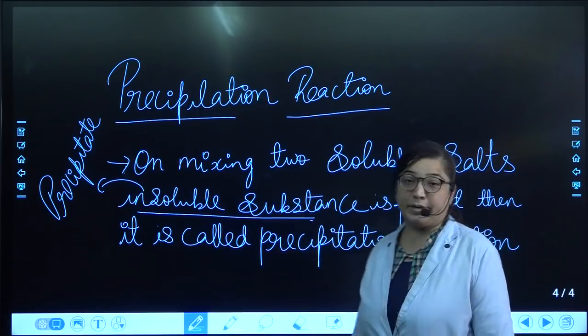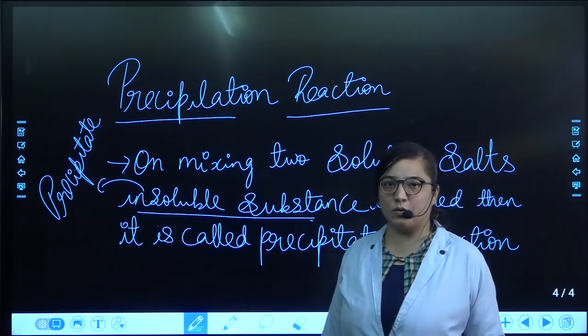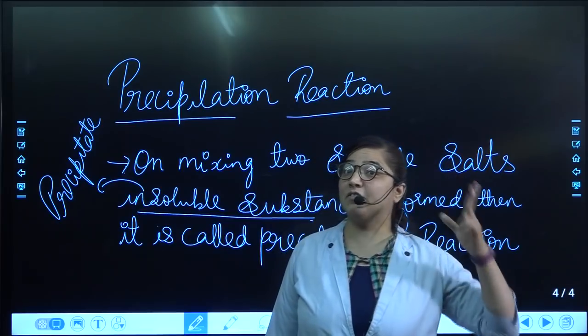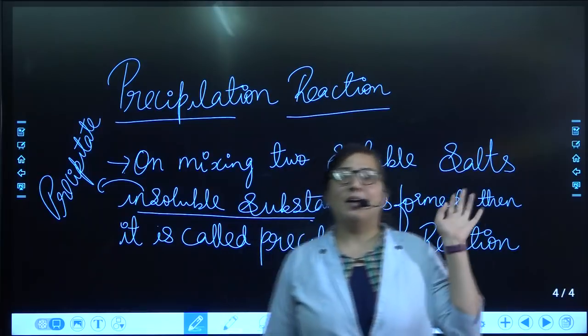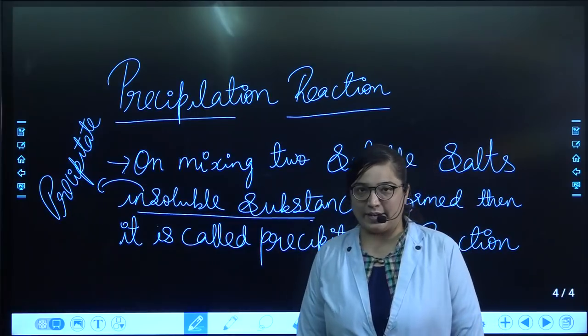So, what is a precipitation reaction? You can get precipitates on your own, at your home, by mixing any two things. How? That you have to find out. But in chemistry, how we will be doing that, I am going to teach you right now.